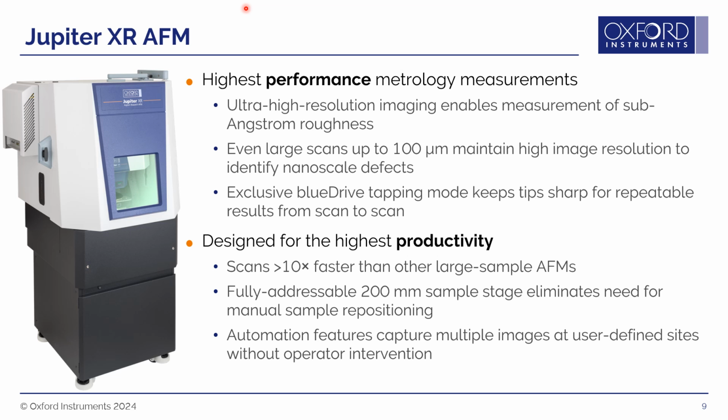At the same time, we can measure features over areas of up to 100 microns per scan, which means that we can characterize large areas of devices in a single scan. And then there's our exclusive blue drive technology, which makes these metrology measurements much simpler and more repeatable.